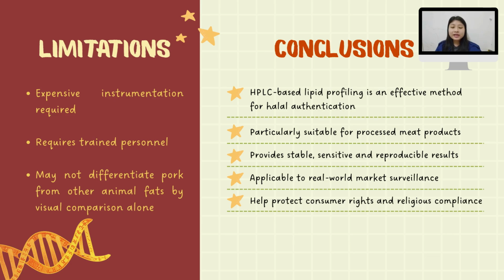In conclusion, HPLC-based lipid profiling is effective for halal authentication, especially for processed meat. It provides stable, sensitive, and reproducible results applicable to real-world market surveillance to protect consumer rights and ensure religious compliance.